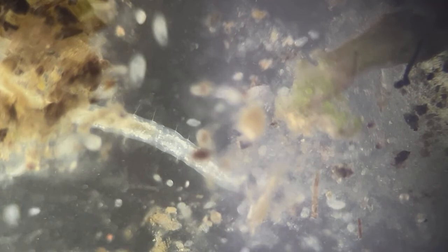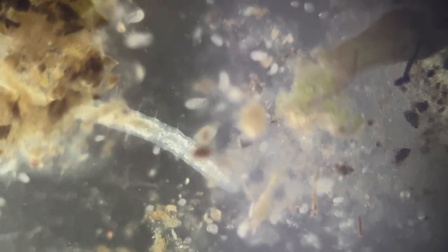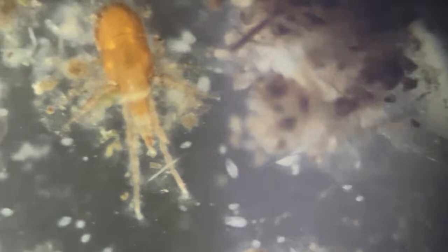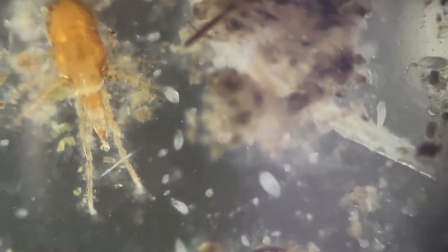Do we find anything interesting? Nothing else but the three-dimensional matrix of this little soup, wherein the life forms are having their own ways of moving around. Isn't it awesome? Just look at this. Looks like an alien world. It sure is an alien world to us.